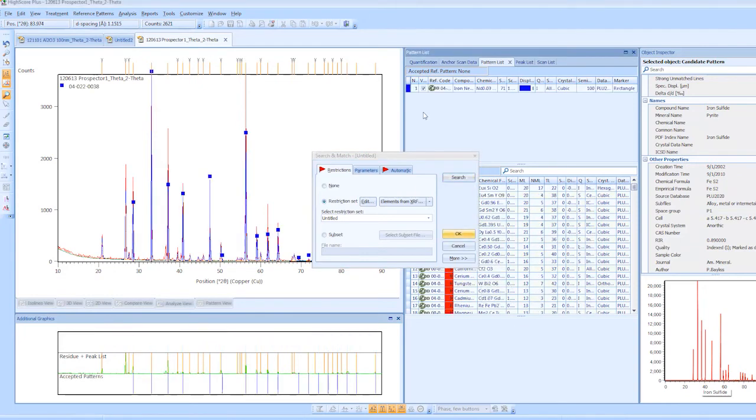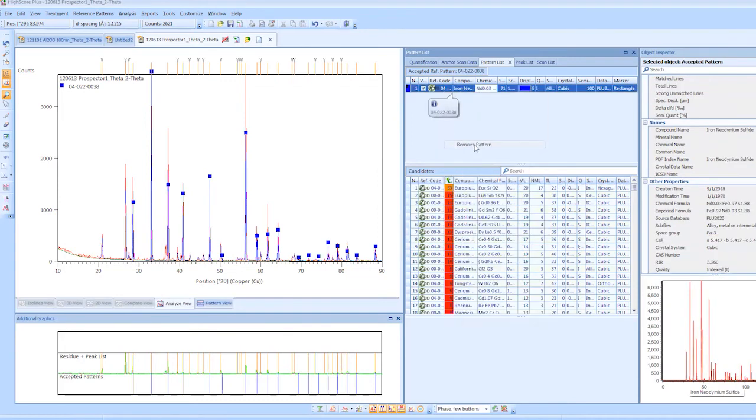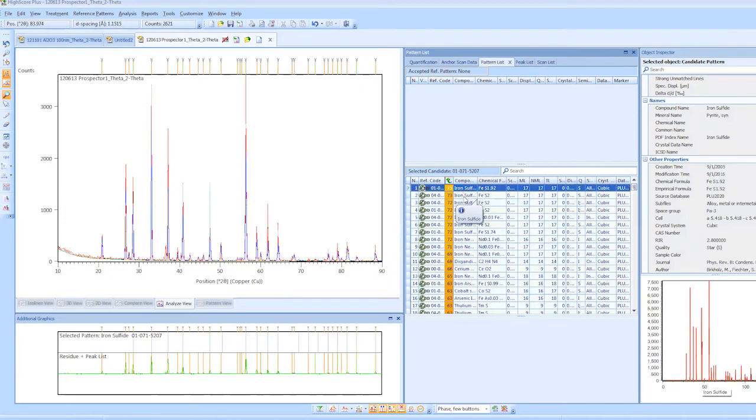Okay, I'm not sure why it does this. It shouldn't put any patterns up here. All right, so again, we'll go through this list again. 1.92. If I go to the next one, it's different. Well, it's not that other one. So it's another star pattern.